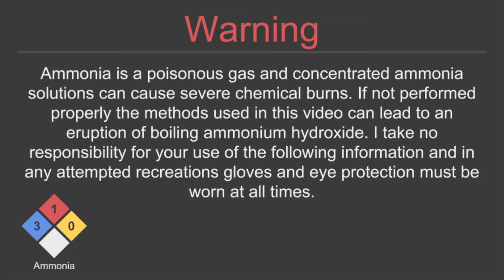Ammonia is a poisonous gas, and concentrated ammonia solutions can cause severe chemical burns. If not performed properly, the methods used in this video can lead to an eruption of boiling ammonium hydroxide. I take no responsibility for your use of the following information, and in any attempted recreations, gloves and eye protection must be worn at all times.